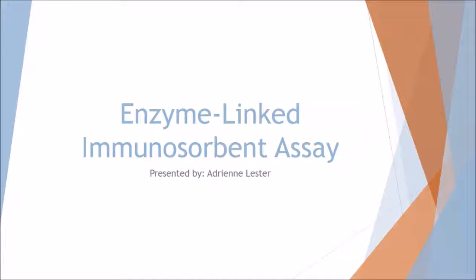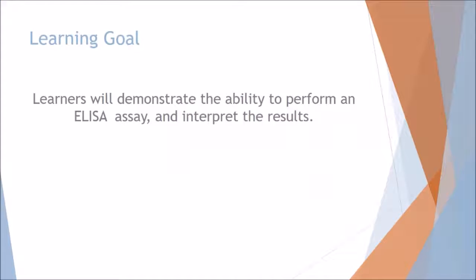Hello, my name is Adrienne Lester, and this lesson today will be on ELISAs, also known as enzyme-linked immunosorbent assays. So the learning goal is that the learner or the student will be able to demonstrate how they can perform an ELISA assay and be able to interpret the results.